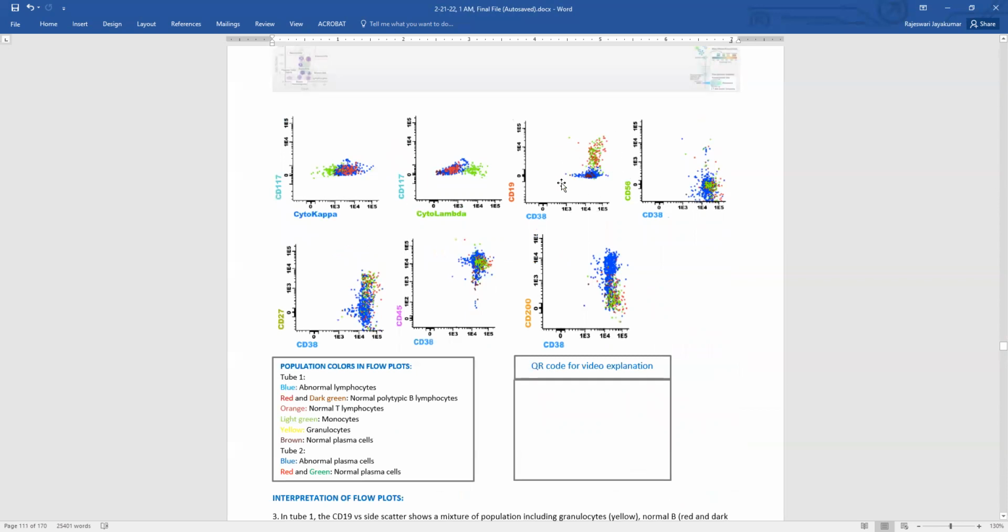They again show loss of CD19. They do not express CD56. They show loss of CD27, CD200 is positive. So neoplastic plasma cells lose CD19, and they can express CD117 and CD56 apparently, and they can also express CD200 apparently, which we see here.